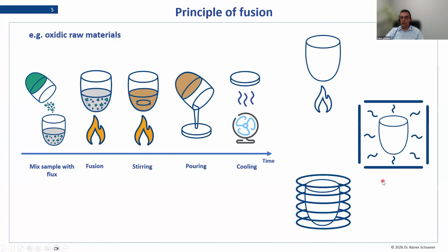To heat, we can either use an induction furnace, or a muffle furnace, or a kind of gas burner. At FLUXANA, we concentrate on gas burners and muffle furnaces. Induction is not our specialty, especially because we would also like to analyze volatile elements, and in induction, the crucible itself is the heat producer, and every crucible is handmade, so every crucible is a bit different.